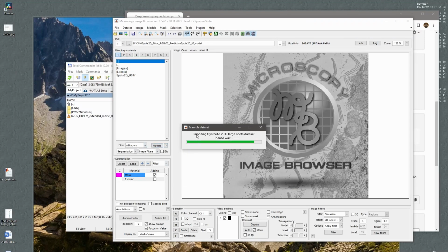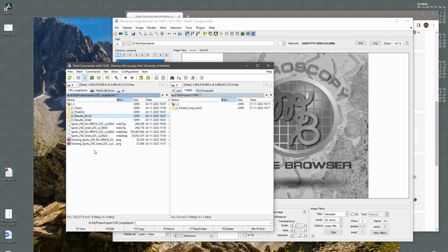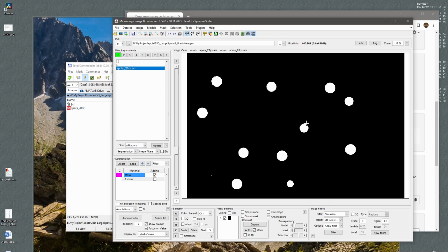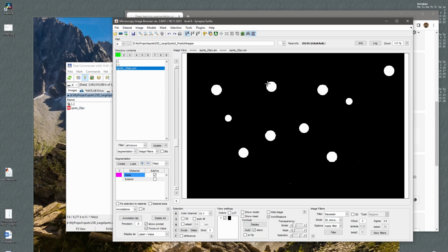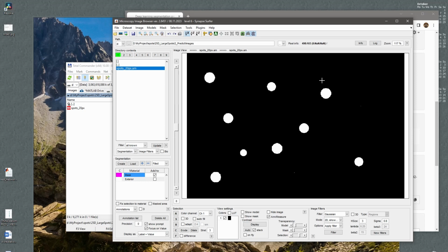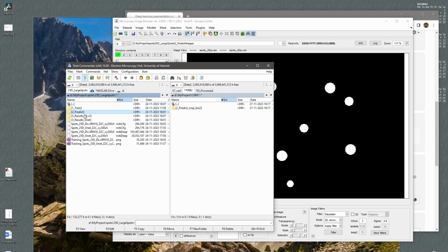This small synthetic dataset should give you the whole idea about how the images need to be arranged, as well as this dataset which is predicted. In this case it's more like 3D spots, like balls, and there is also noise, which is spots that are present only on a single slice. The idea is that the network is trained in order to separate these cases. Let's see the prediction.